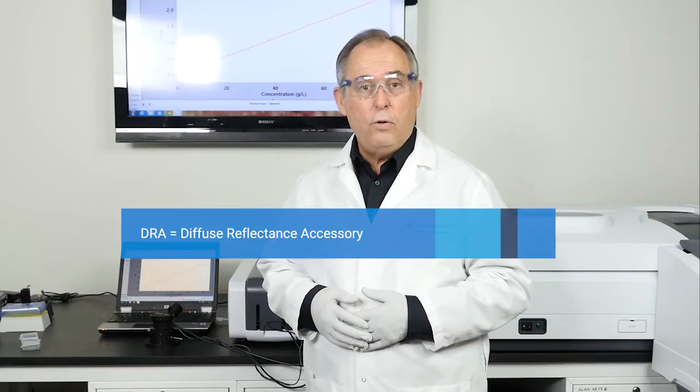Now most people say you can measure powders, a solid sample on a UV-Vis spectrophotometer. Well, you need a special accessory, and that's called a remote DRA, or diffuse reflectance accessory.